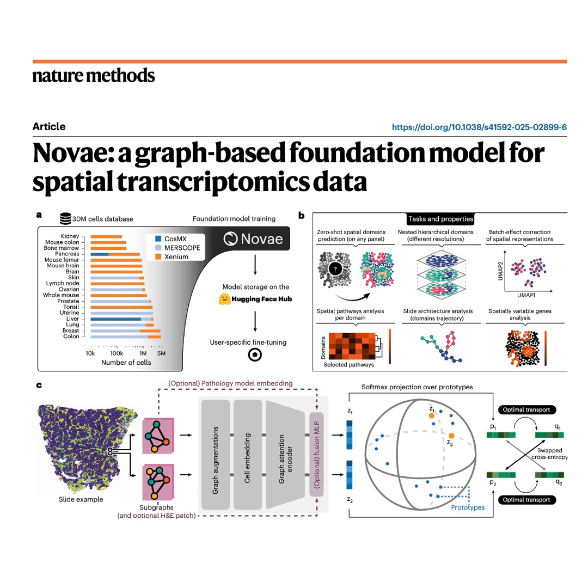How did the testing prove that? Well, in a mouse brain robustness case study, even when a large region of tissue was artificially removed from one slide, Novae maintained high domain continuity. We measure this with something called the FIDE score. A high FIDE score means the learned domain boundary stays smooth even with missing data. Nice. It also kept a low post-split JSD score, which confirms it didn't artificially blend unrelated tissue types together, so it resisted that overcorrection perfectly.